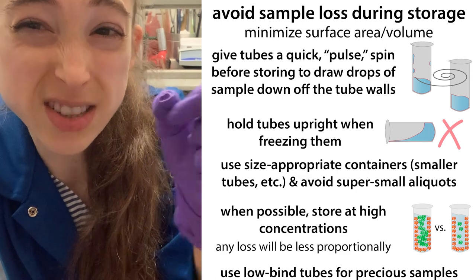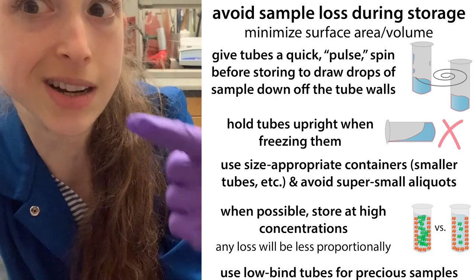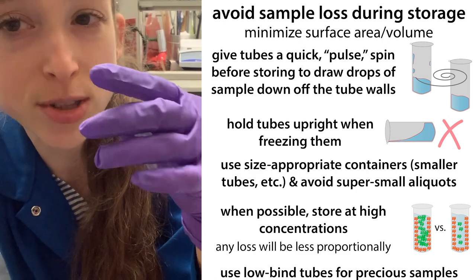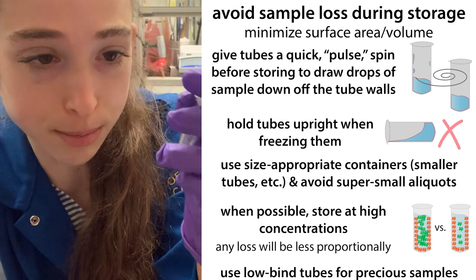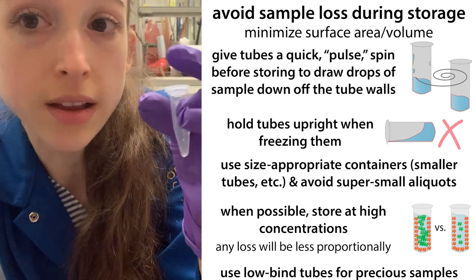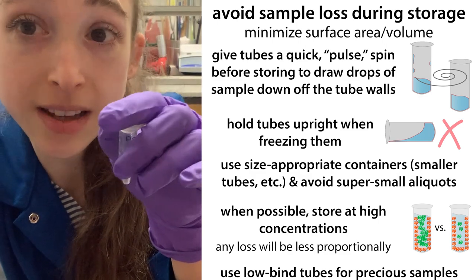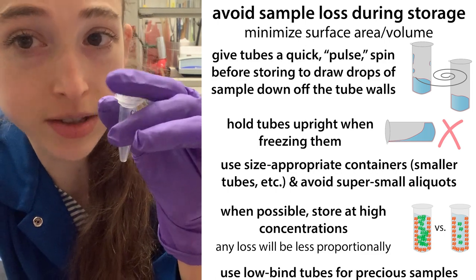Another time this comes into play is if you're using syringe filters — be sure to use a smaller one if you have smaller samples, because you're going to lose a lot that's just stuck in the filter. So be sure to use equipment that actually matches the size of your samples. Also, don't try to work with too tiny of volumes, because then you're inevitably going to have a high surface area to volume ratio.